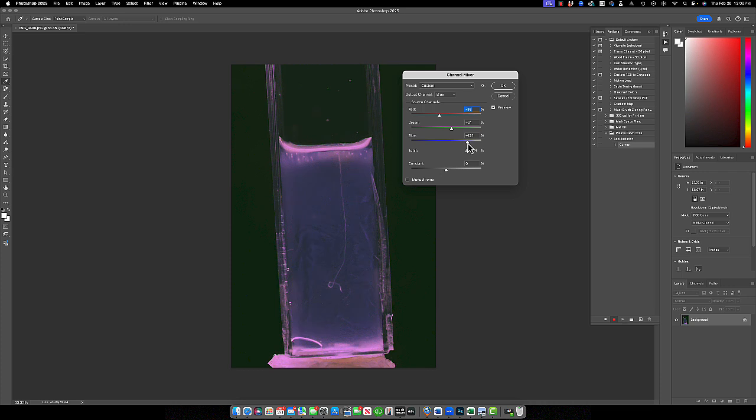And that is plausible. So you can see here the agar, now we're starting to find some blue, whereas other reflective areas are highlighted much more pink. So that's really the goal, is to see if we can create two different colors, which will make the 3D modeling process much more simple.